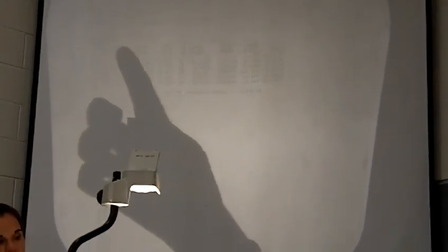So this is an example of GC data that you will get. You will actually get 2 pages. So you're going to get a peak list, so it's all the peaks that came off. And you'll get the retention time, the start retention time, the end retention time. This is the average retention time that you record. Then a bunch of information about peak height and peak area. And then what percentage of the total was that peak, okay?